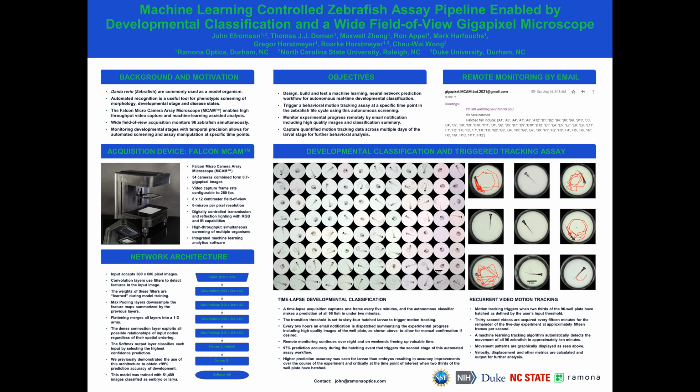The rapid developmental timeline of zebrafish yields a tight but accelerated window to explore toxicity, behavior, and disease. Disease in particular must be studied with a developmental context to elucidate mechanisms and progression. We report the construction and validation of an assay pipeline controlled by machine learning software in which motion tracking behavioral assays are triggered by developmental classification and the transition from the embryo to larval stage.